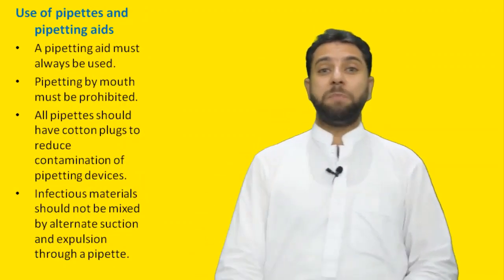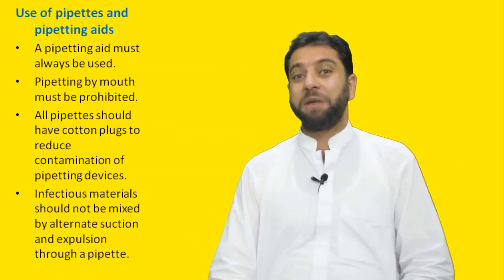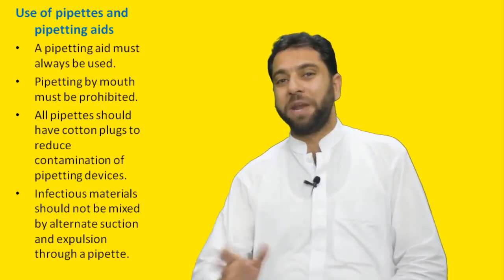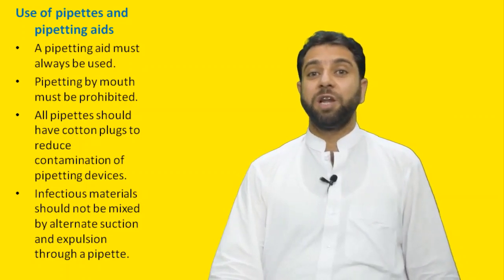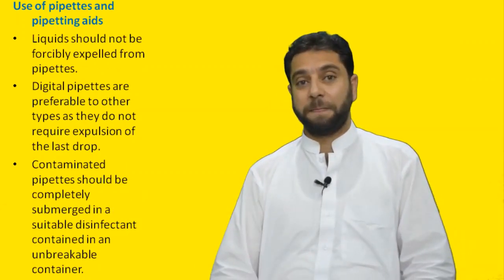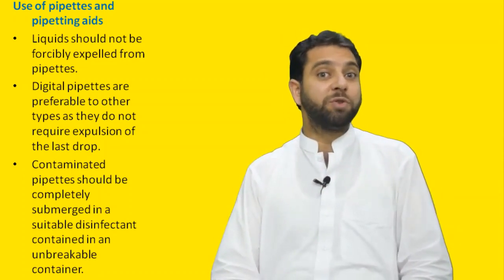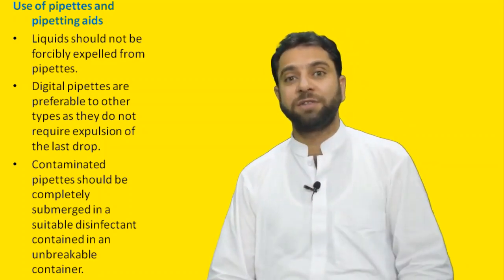Whenever we are going to use pipettes in the lab, we must use a pipetting aid. Pipetting by mouth must be prohibited. All pipettes should have cotton plugs to reduce contamination of pipetting devices. Infectious material should not be mixed by alternate suction and expulsion through a pipette. Remember, do not forcibly expel the liquids from a pipette. It is preferable to use digital pipettes if available, as they do not require expulsion of the last drop.